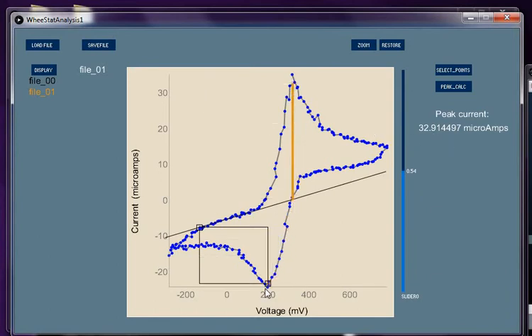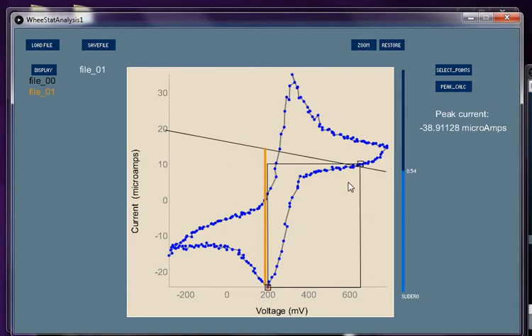We can get the other one now. We're just going to pick a point down here for our peak. We're going to move this up to here for determining our baseline position. We're going to now reselect points, hit the calculation again and you can see that our baseline is messed up so we need to adjust this so that it goes through the baseline data here. Now we have a reverse current peak of 30 microamps. These are fairly similar as you expect for a cyclic voltammetry experiment.